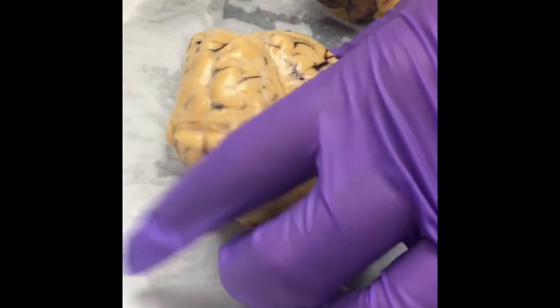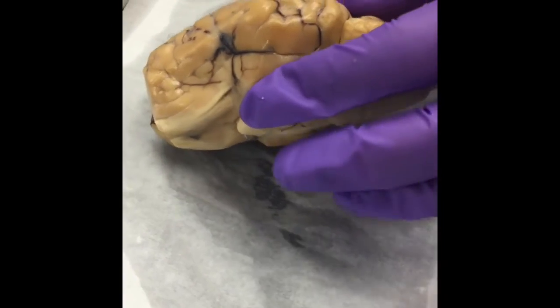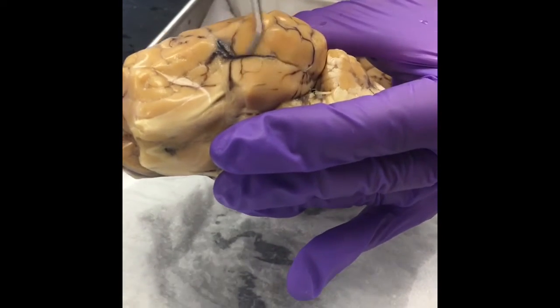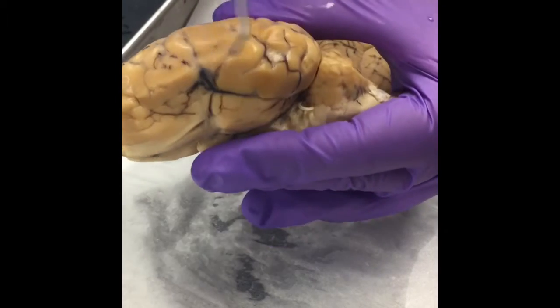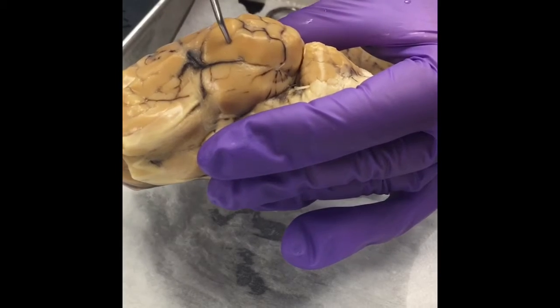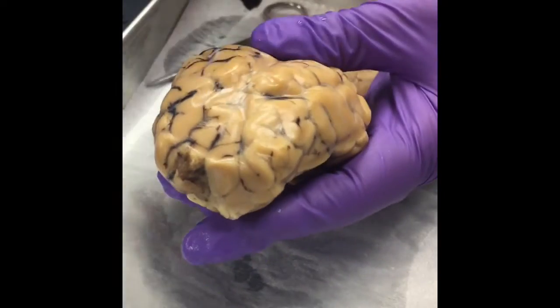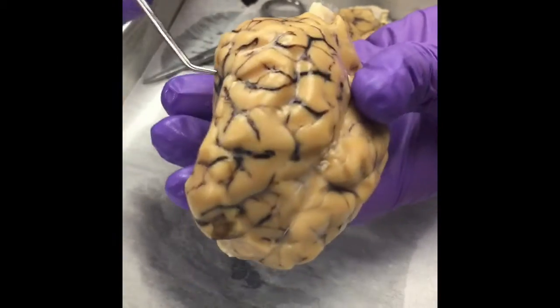Last lobe, because remember there's 4, the last lobe is on the side of the brain. Now this is where it's a little bit different because it's a sheep head and not a human head, because our heads are more rounded, whereas theirs are flat. So the temporal lobe on the sheep brain is a little more to the side, whereas ours would be up a little further. But this is the temporal lobe on the sheep brain. And it's only on one side? Nope, one on each side. Okay. There and there. Whatever we have on the right, we have on the left. So 2 frontal, 2 parietal, 2 occipital, and 2 temporal.